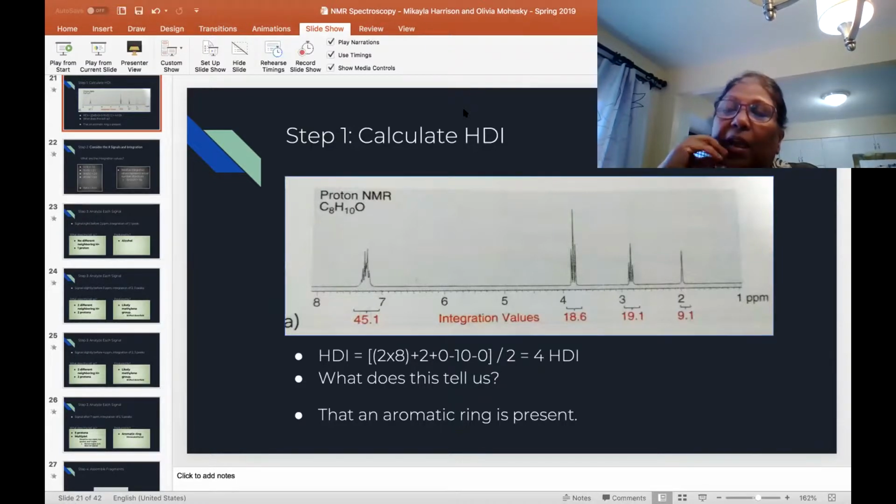Don't forget that, because you can go back and check your own answer. See if you can tell if the splitting is correct and if the positioning of the groups on the spectrum looks fine. Does it match up with the chemical shift values that it's supposed to have from the table, and so on.